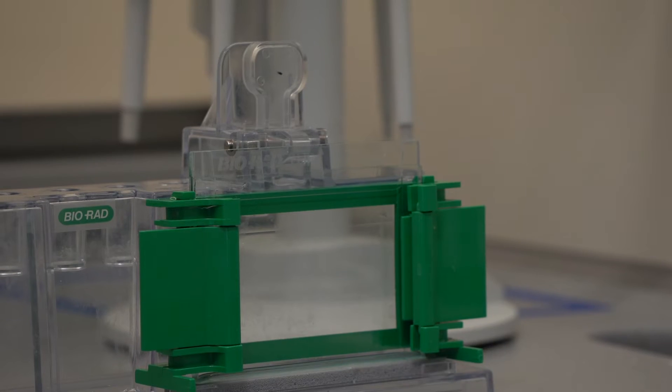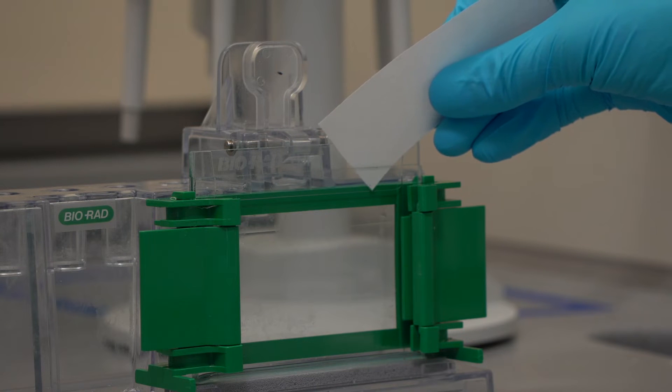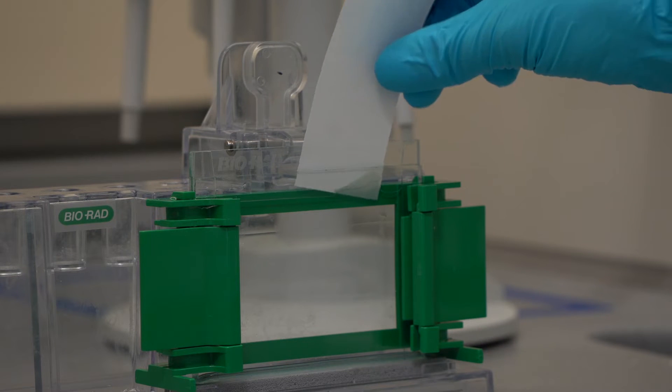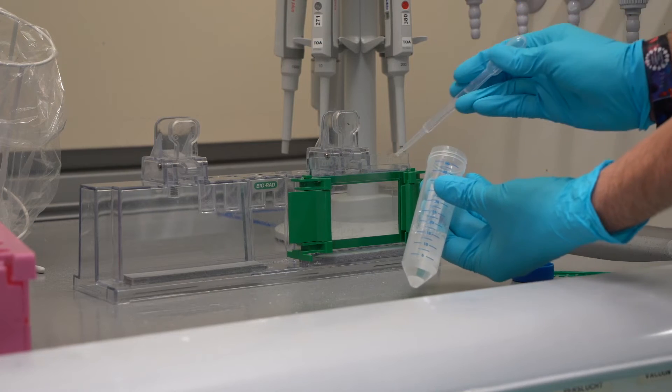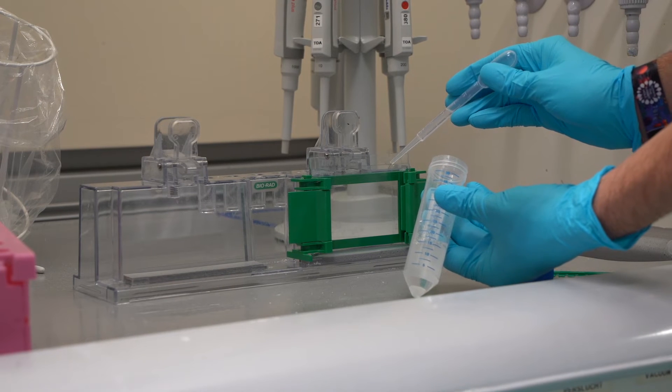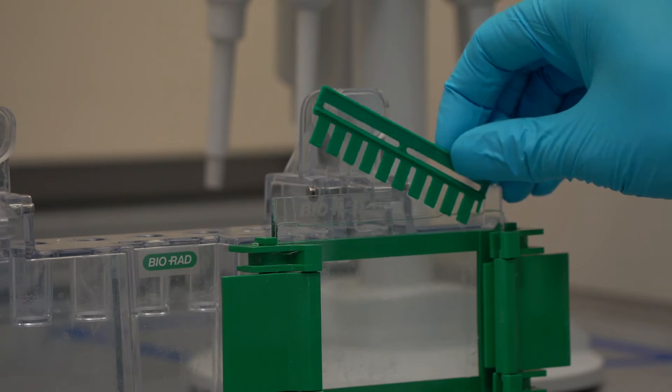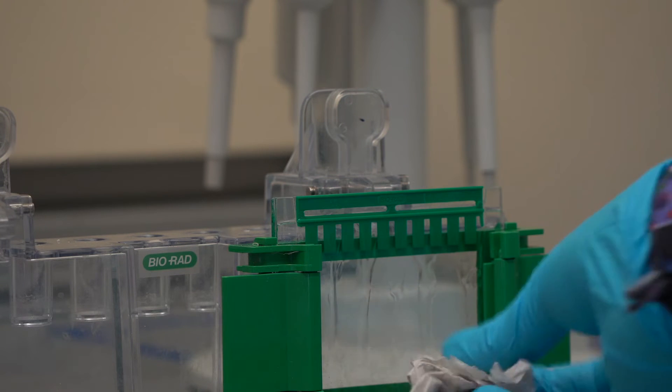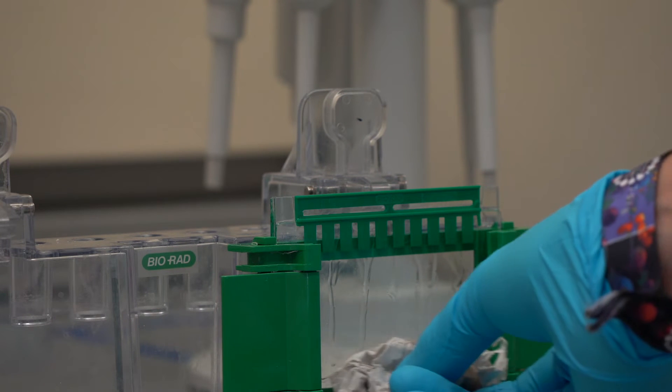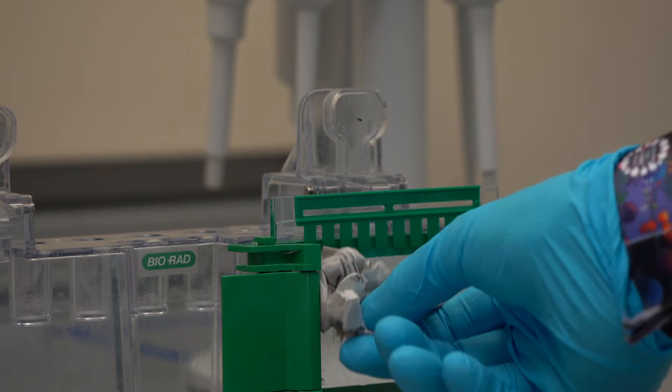After the polymerization of the running gel, the isopropanol is removed with a filter paper. Pipette the stacking gel on top of the running gel. Place the comb in the gel in between the glass plates and immediately remove the excess liquid. Ensure that no bubbles form between the comb and the gel.